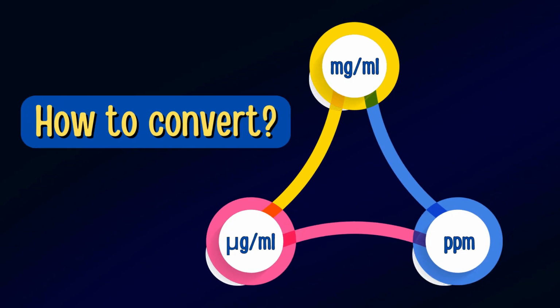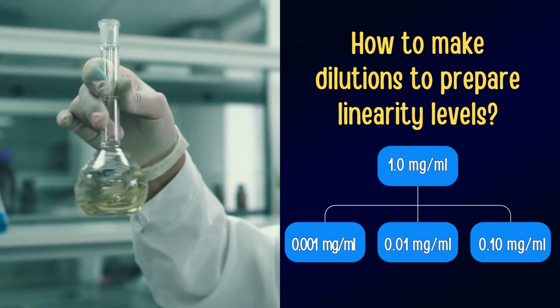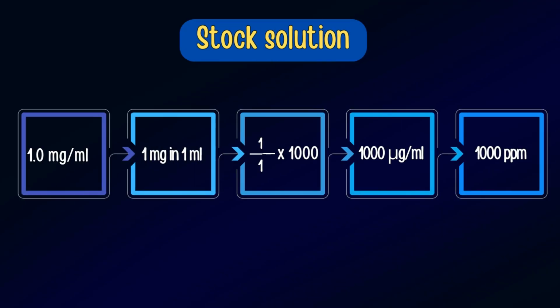To simplify this, first we will understand how to convert mg per ml value into microgram per ml value or ppm value, and then we will understand how to make dilutions to prepare linearity levels so as to achieve these concentrations. 1.0 mg per ml can be converted as 1 mg in 1 ml, that is 1 divided by 1 into 1000 corresponds to 1000 microgram per ml or 1000 ppm.